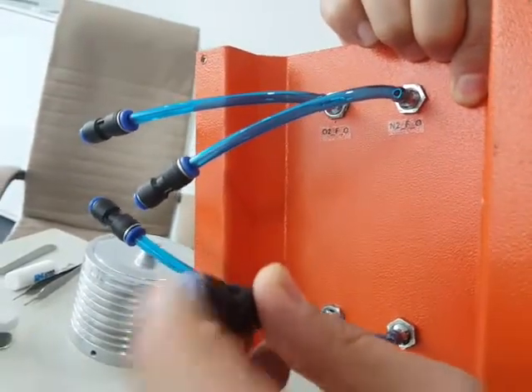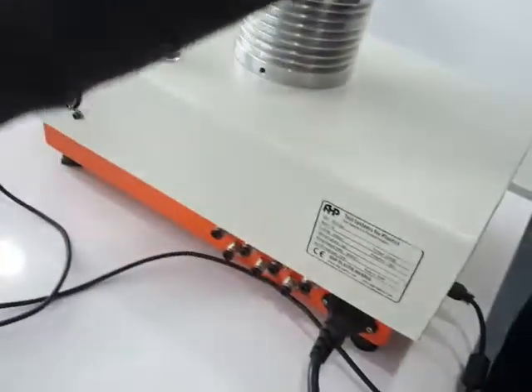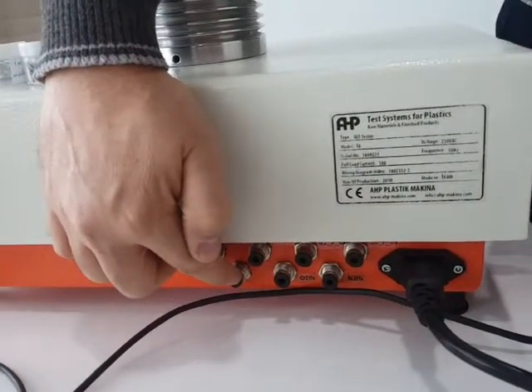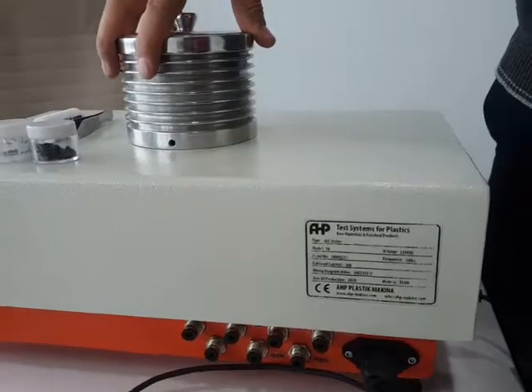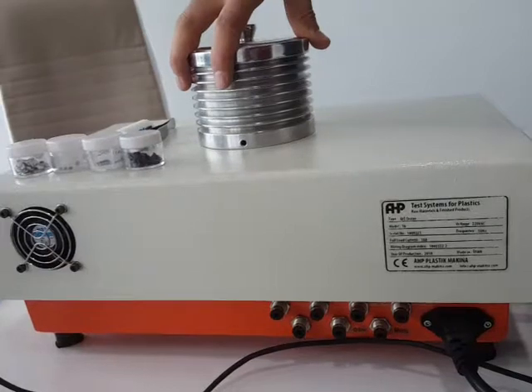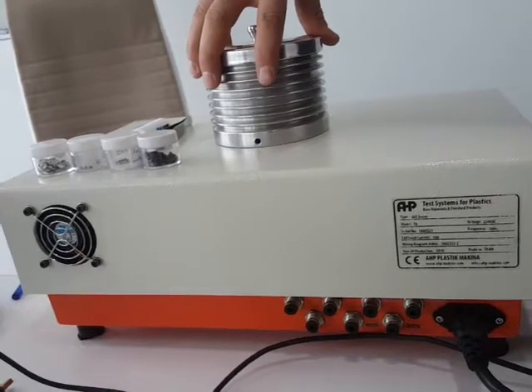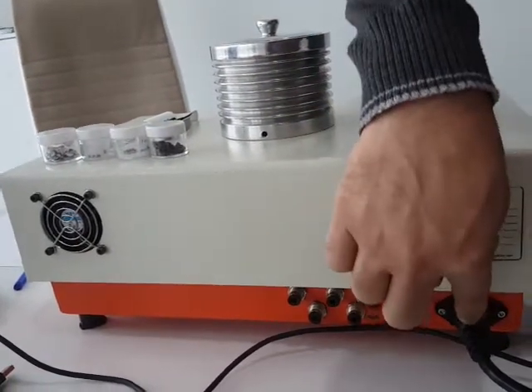The operator can easily connect the flow meter connections to the machine. There's also an air input used for chamber cooling. Whenever a test finishes, it opens automatically to cool the chamber so the next test can be started as soon as possible.